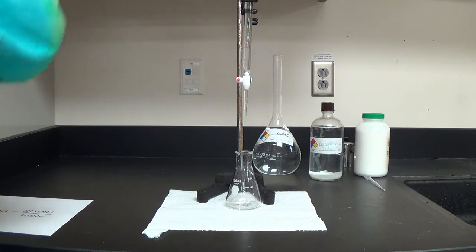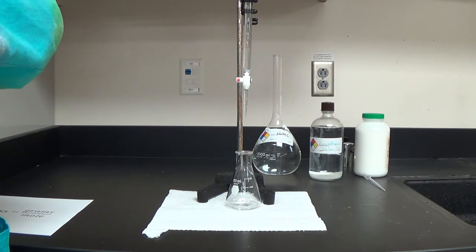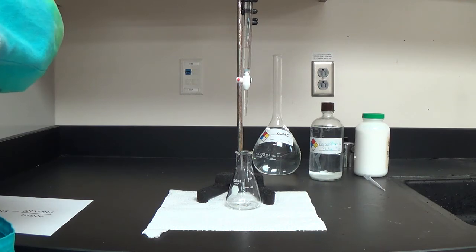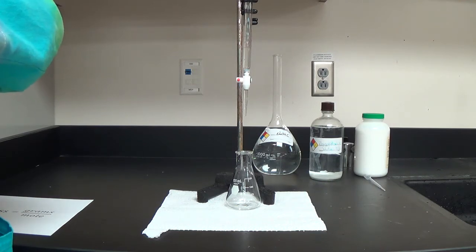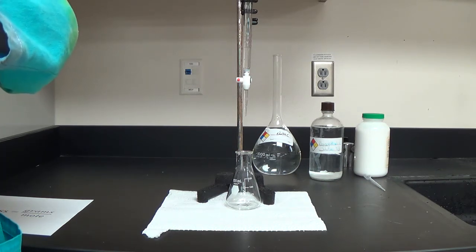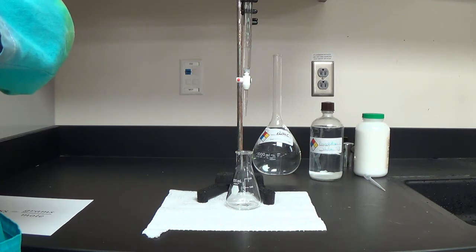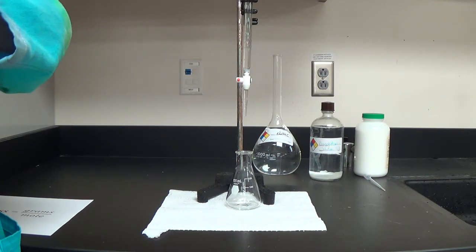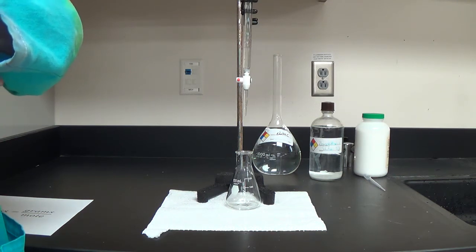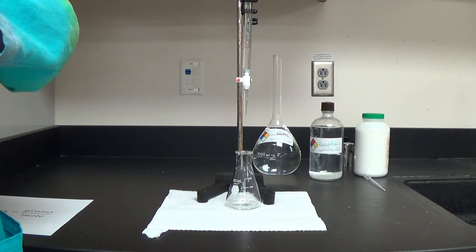Welcome to our AP Chemistry discussion of titration and standardization. We're going to do a titration, a very useful, very practical, very common technique for analysis. Titration is probably better for everything than colorimetry.